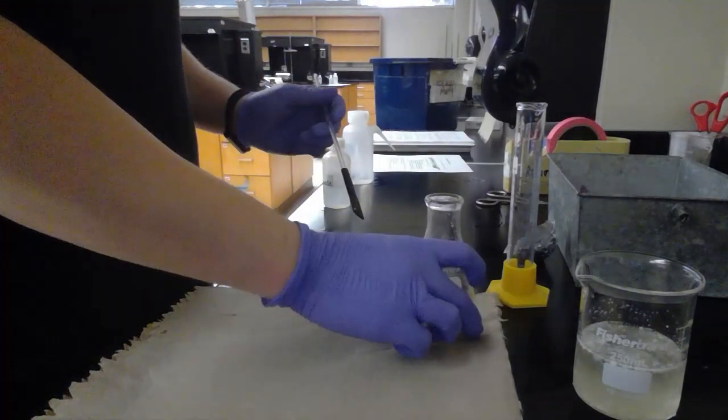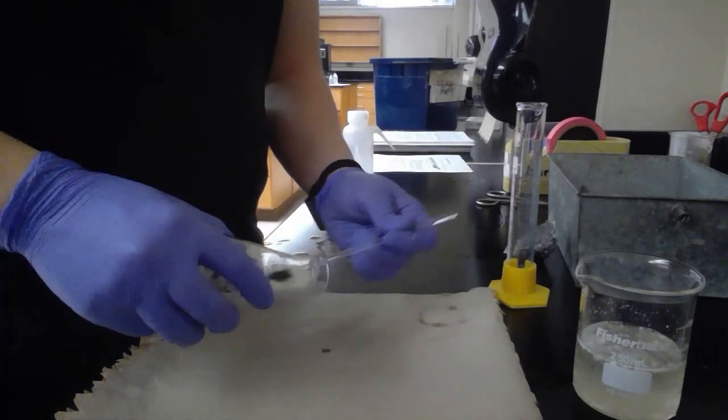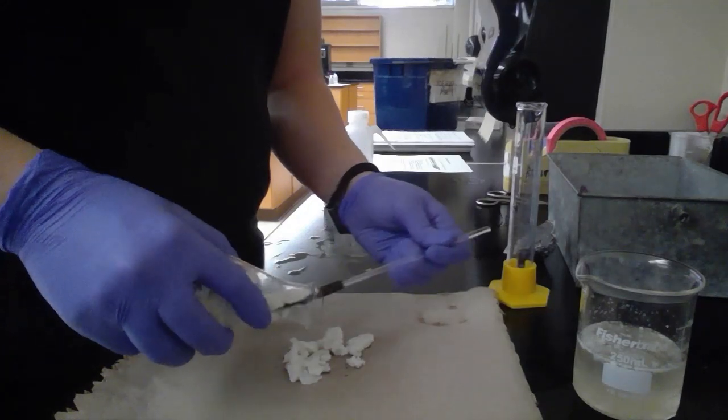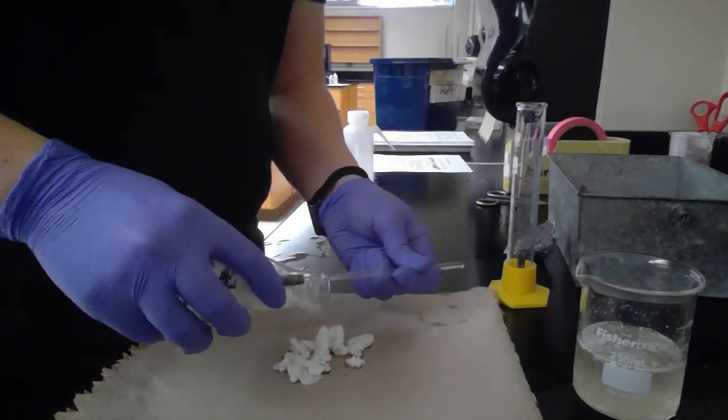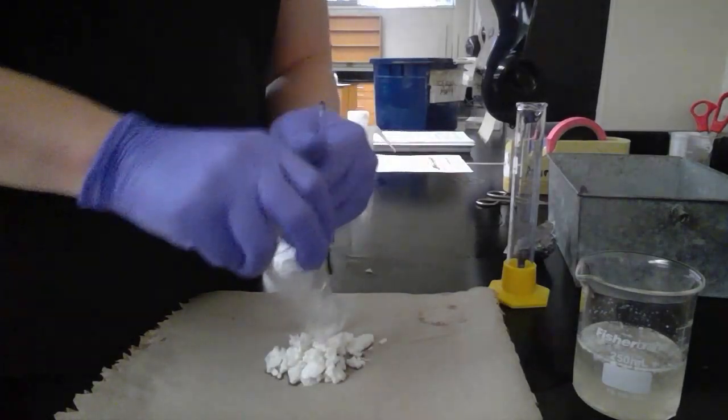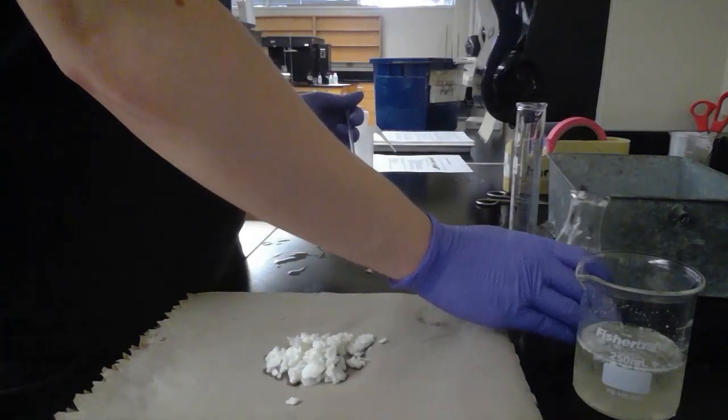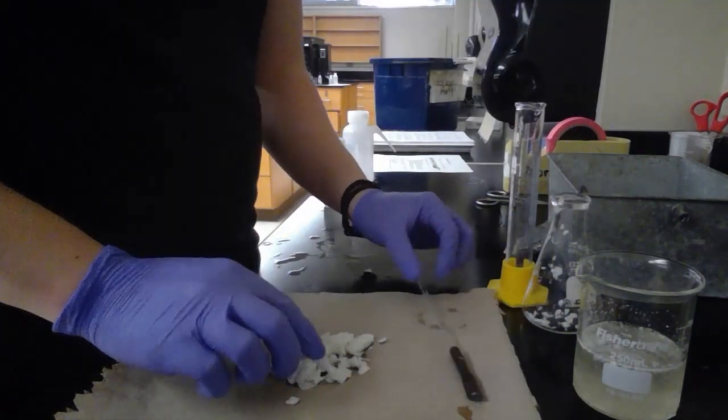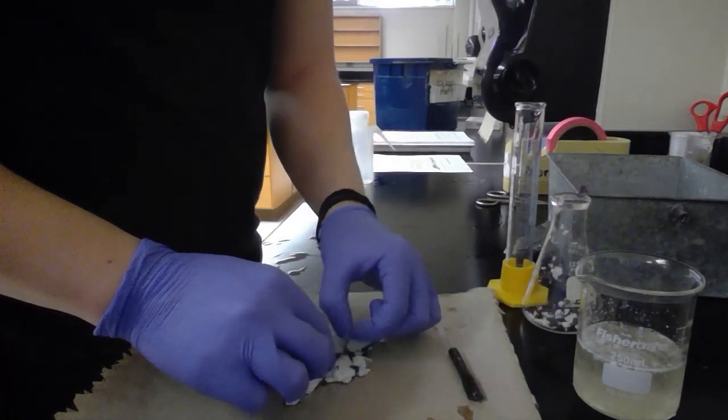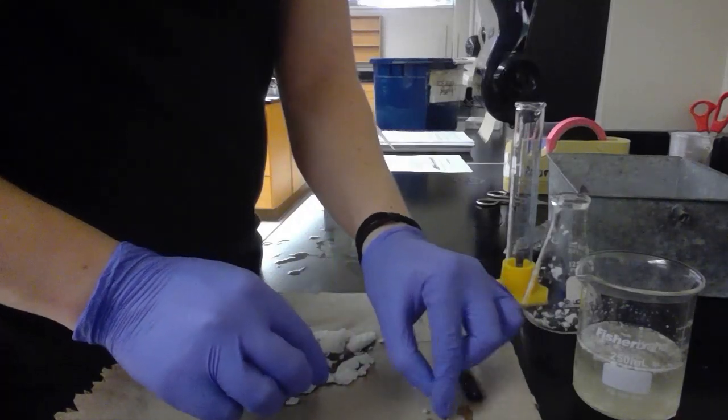Now we're going to transfer the soap from the flask onto a paper towel and dry it out. We're removing the boiling chips so they don't add into the mass when we weigh it later.